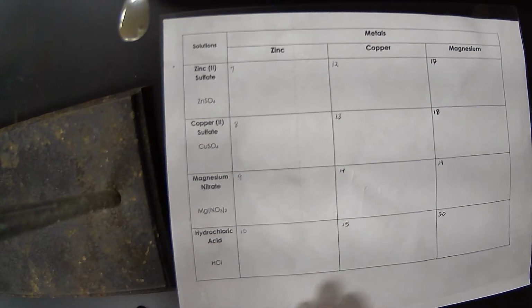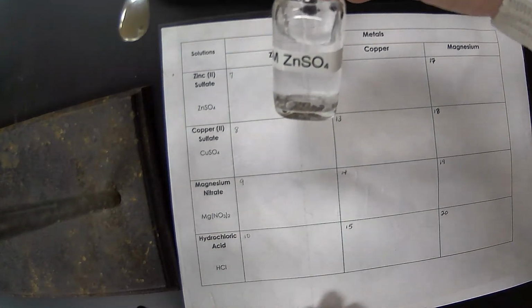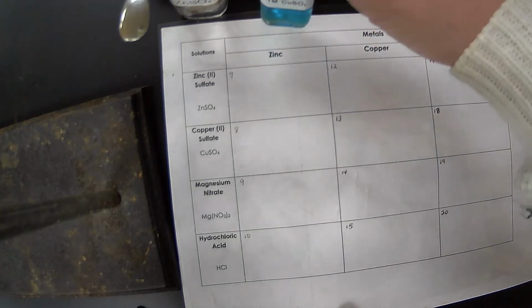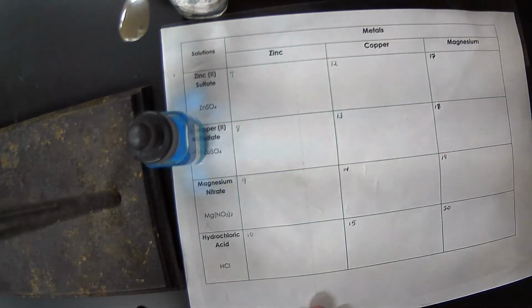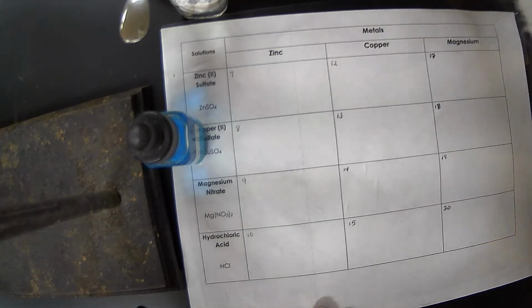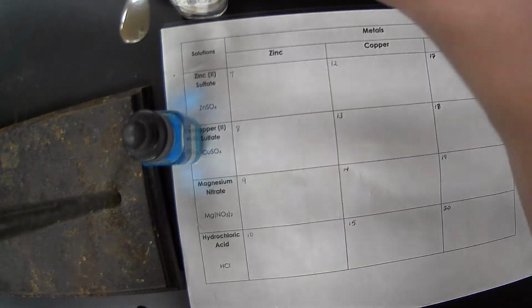Okay, so for the lab today, we are working with zinc sulfate, which is this solution right here. It's odorless and colorless. Then we have copper 2 sulfate, this blue solution. We know copper solutions are always blue. And then we have magnesium nitrate, also a clear solution, and then we have hydrochloric acid, this, another clear solution.